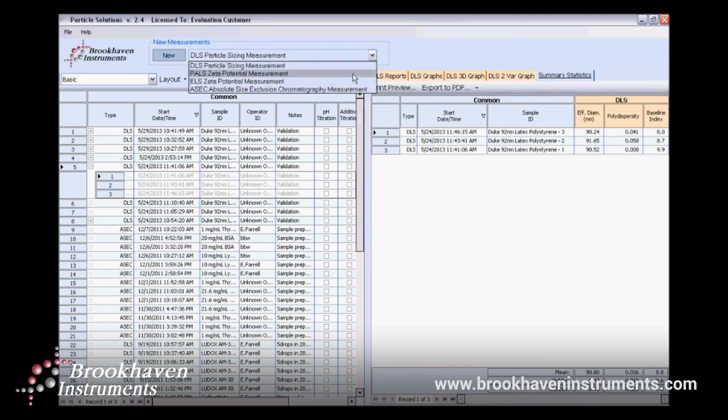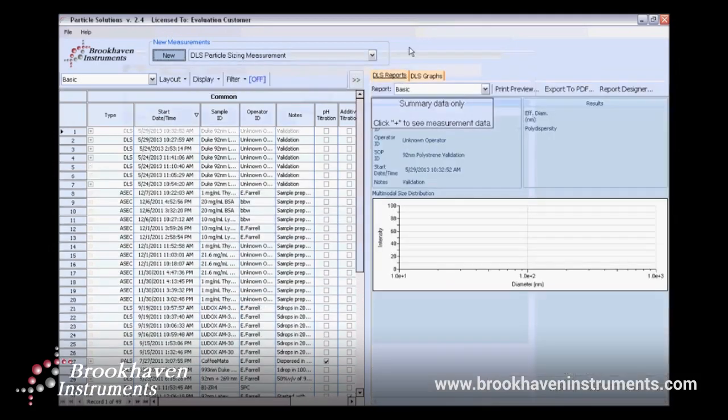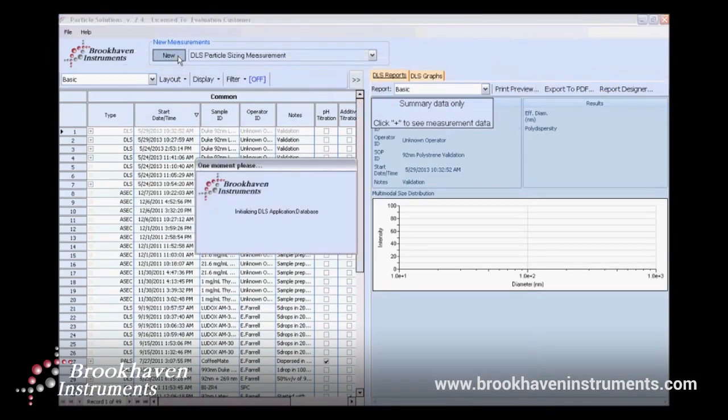With the correct technology selected, click New to open the measurement applet window. Particle Solutions will take a few moments to check to make sure the computer is paired with the Brookhaven system. Then it will open the measurement applet window.